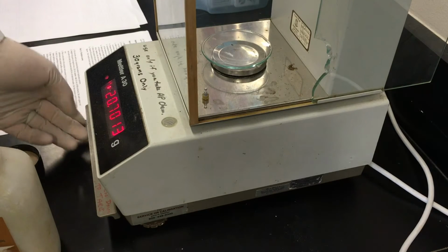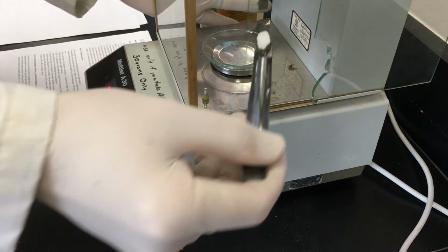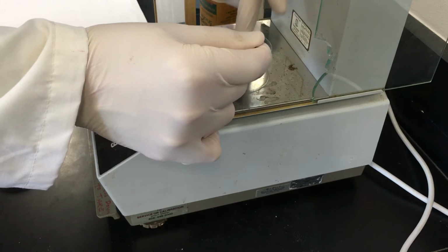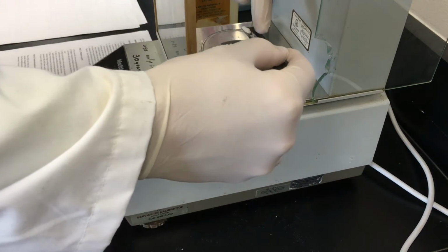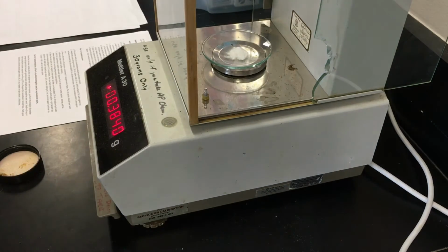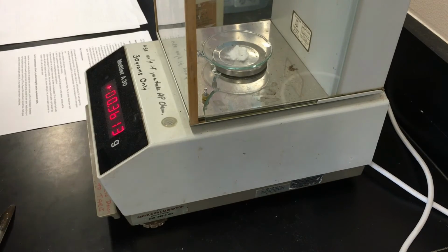So first step, 0.36 grams of aspirin. So it actually lost? And 0.3613.